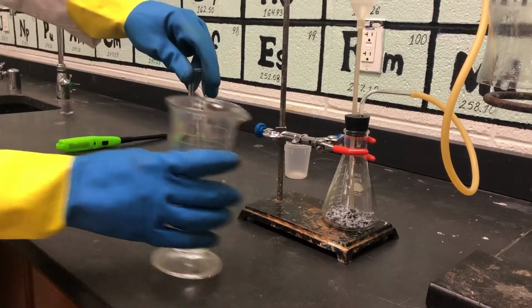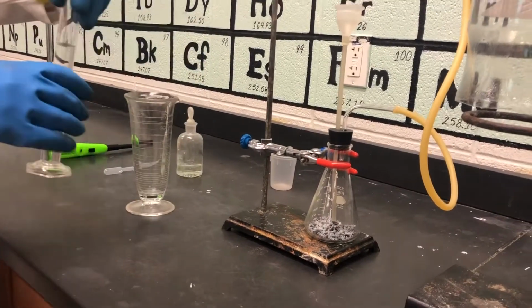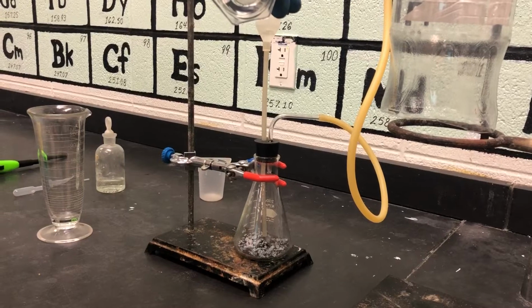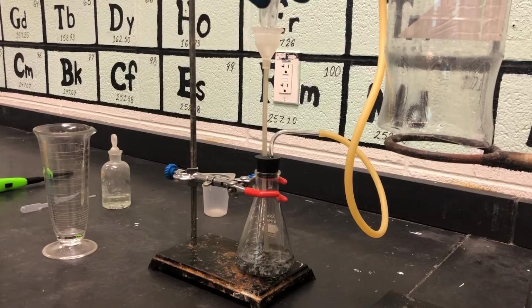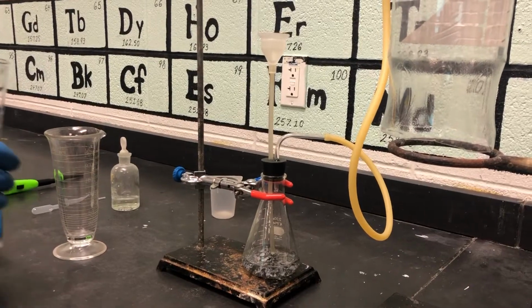And you can see it was a little bit off, about 1 milliliter off, which is not bad when you consider how wide the top is. But anyway, we're going to add that to our reaction vessel. This is just going to be the medium for the reaction. All I'm wanting to do is just cover the bottom of that.